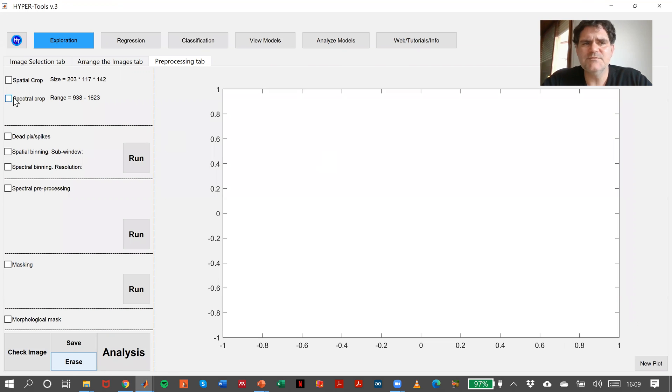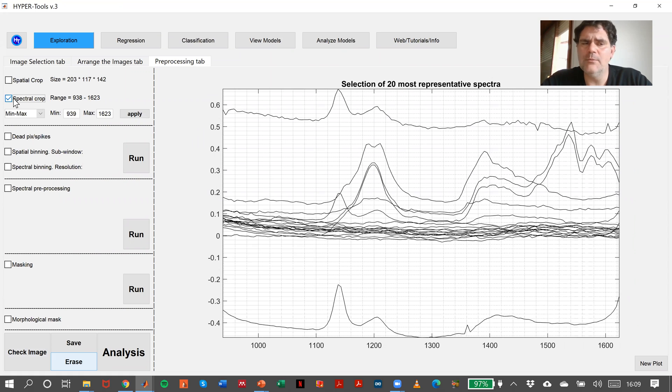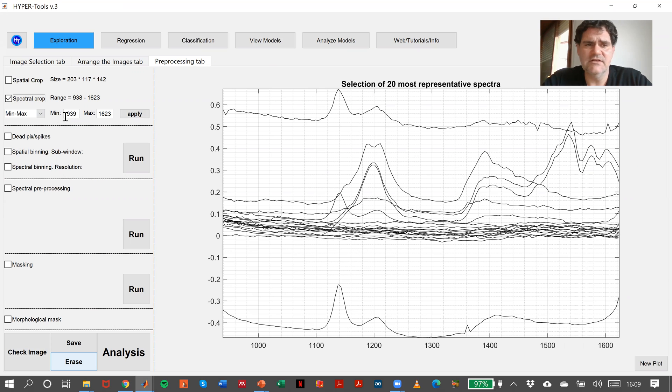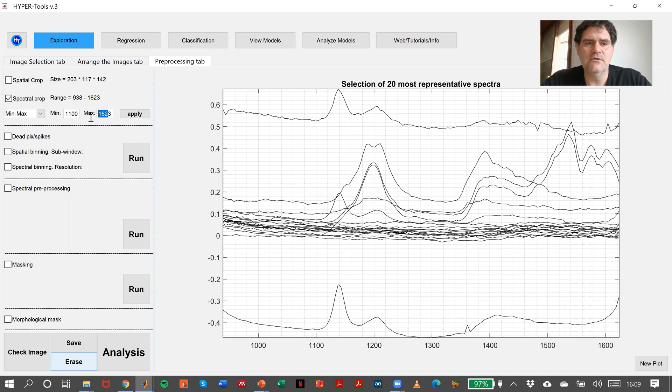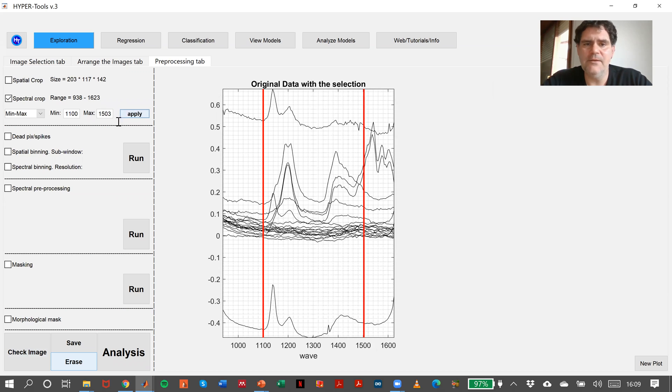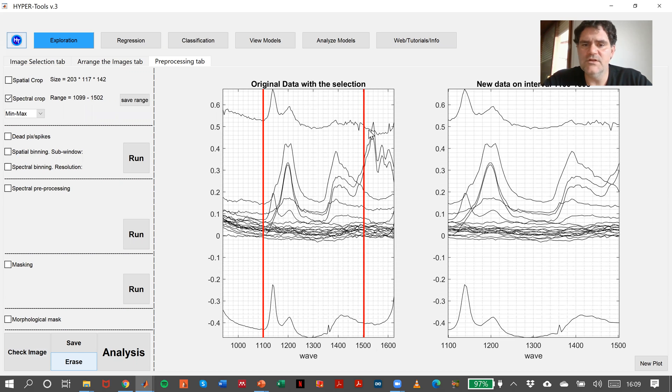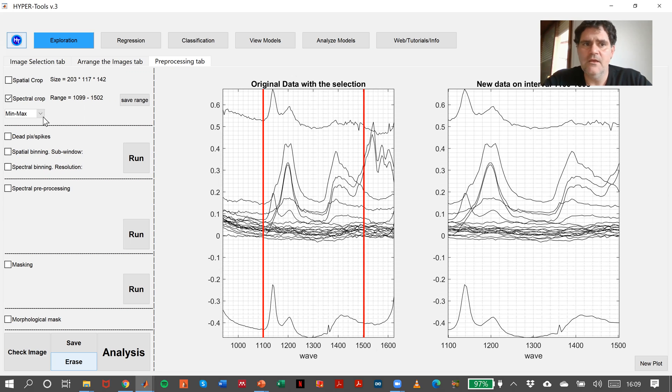With the spectral crop, we have two options. Min max, that is, we can say, for instance, instead of 939, we can say we want from 1,100 and the maximum 1,503. So if we apply, it will select this area. We will obtain this area.